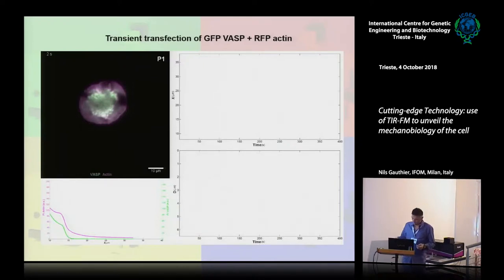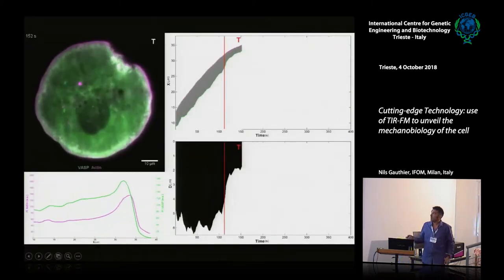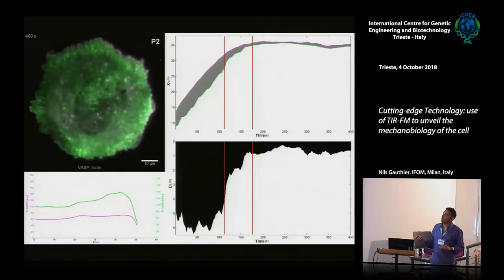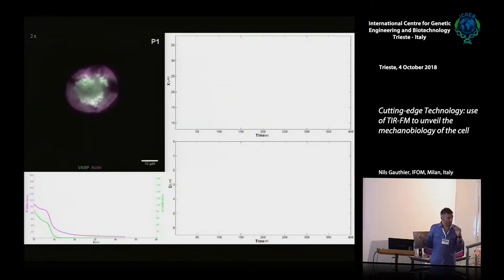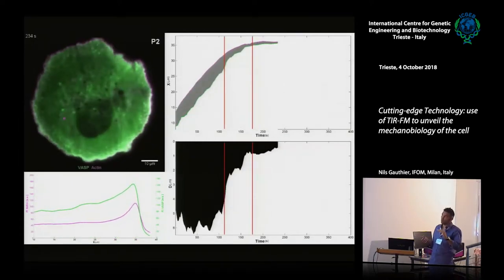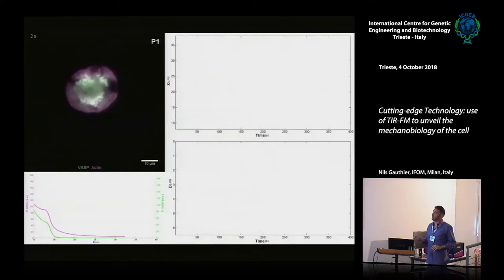And we made some kind of software to analyze the motility of the cell. Then you can see here in TIRF, there are two. Here you see the nucleus. If you are in very shallow TIRF, you can modify the angle a bit. You have no nucleus normally, but if you go a bit deeper, because the actin generally is a bit above in the cell, then you can also have a bit of nuclear staining.